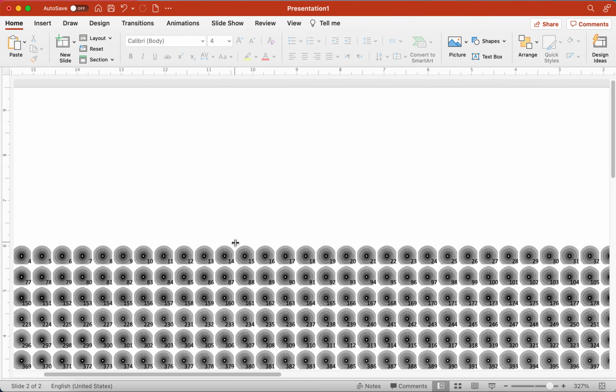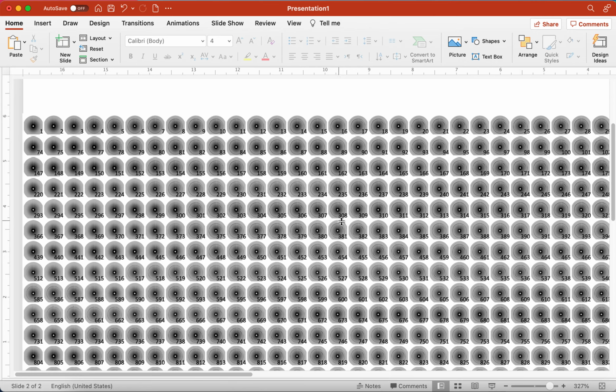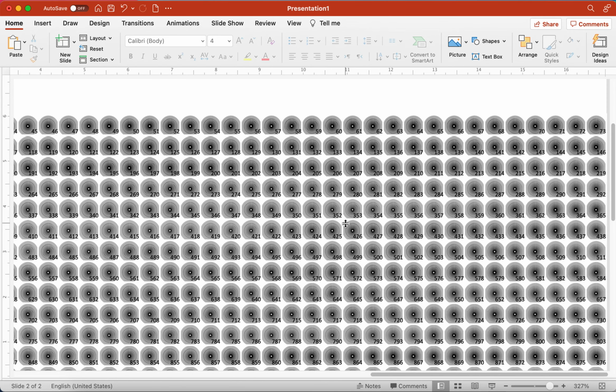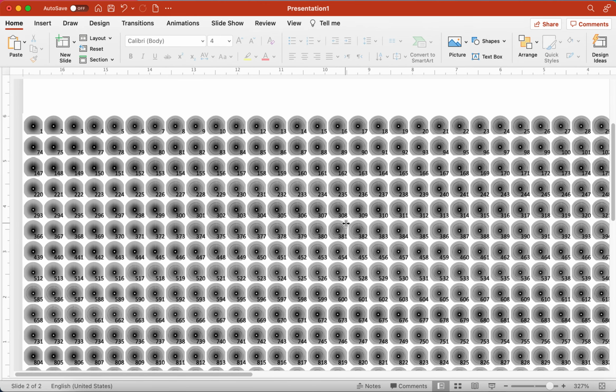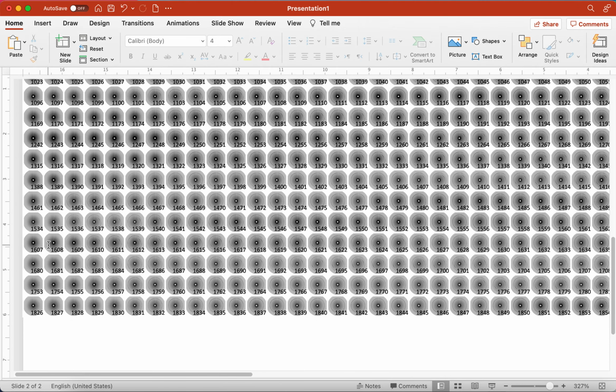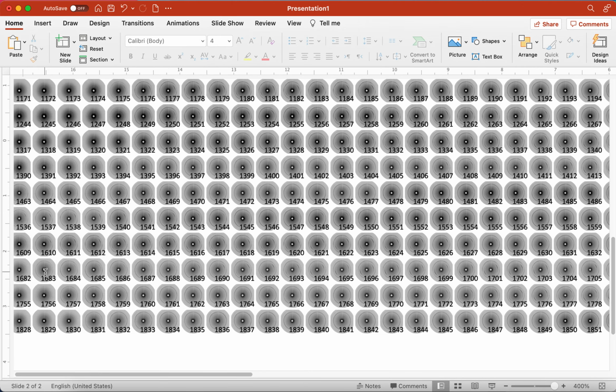So now we have our diffraction patterns in our composite map numbered according to the file number. And this is quite important if we would like to identify which diffraction patterns are air and which are actual crystalline sample.